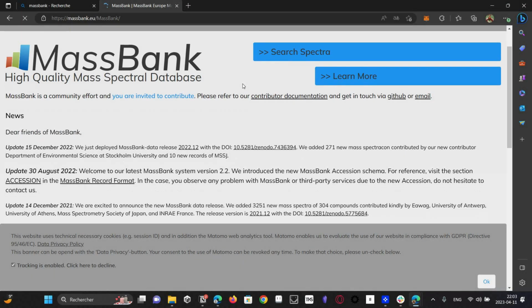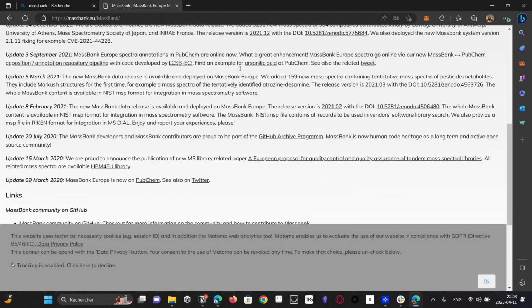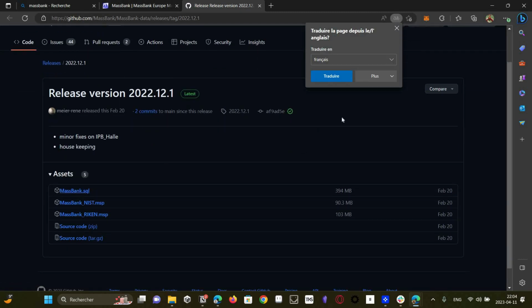So in essence, I use the MassBank database, a database formed by a set of 16 research groups that contains the data on electrospray ionization, metabolic compounds, synthetic drugs, and many other random things I can't pronounce. There. Now let's move on to my project.